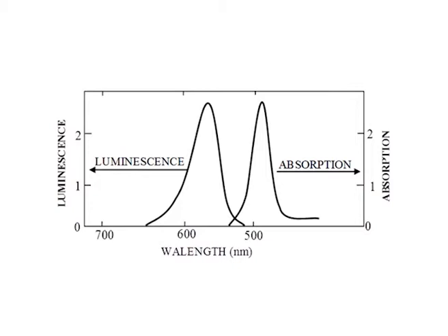There are a few disadvantages associated with lasers. The casework has to be carried out at the Fingerprint Bureau. Portable lasers which may be carried to the scene of crime are not yet available. Laser equipment is quite costly. When optical spectroscopic techniques are used in combination with lasers, the operational procedures become tedious and complex. However, the end results obtained with lasers are so remarkable that one becomes inclined to believe that their merits outweigh the demerits.